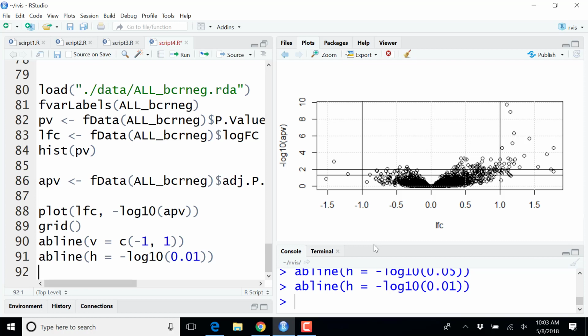But whatever thresholds are used, here I have a continuous distribution of points. As soon as I have these outliers, these are probably the more interesting points. And even though this one does not have as good a value as here, if I'm interested in differentially expressed downregulation, well, this would clearly be my candidate of interest, irrespective of thresholds.